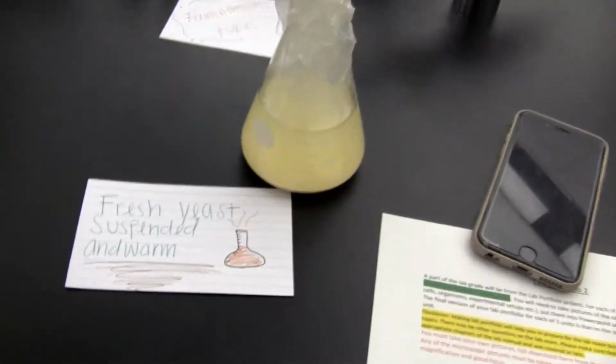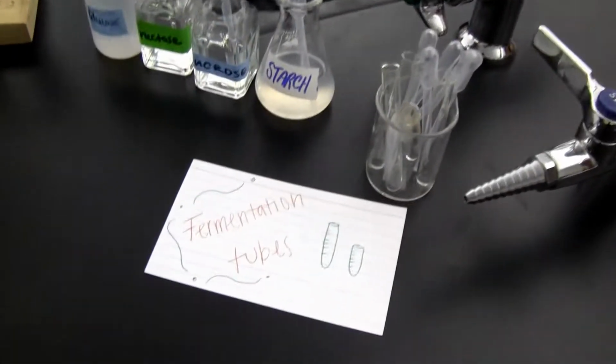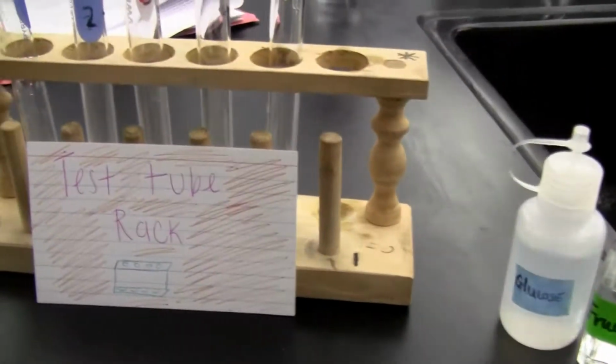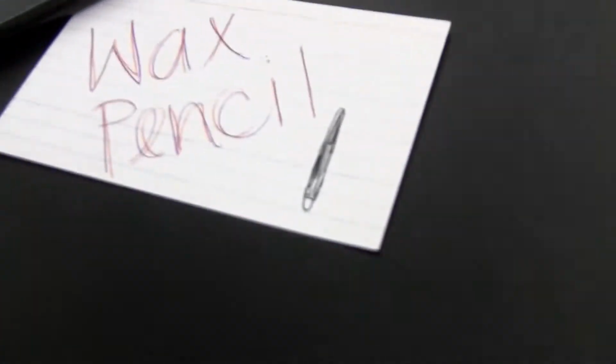Okay, so here are our supplies. There's the fresh yeast, suspended and warm. There's the fermentation tubes, right there. There's the starch, the sucrose, fructose, and the glucose. Well, we don't have the label. There's the test tube rack, and there's the 5 test tubes. And then this is the wax pencil. There are the materials.